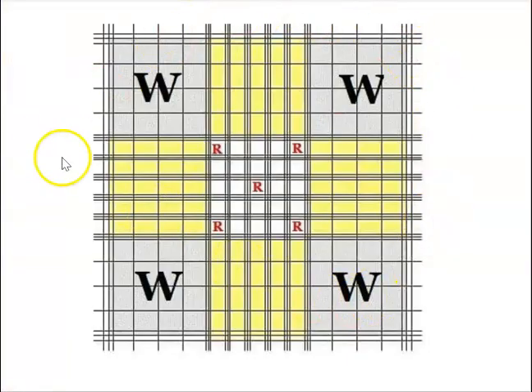Okay, so this is to show you the grid pattern on your hemocytometer. So you have two of these grid patterns on your hemocytometer, and this will be roughly what each hemocytometer looks like. It may differ a little bit depending on the brand of hemocytometer you're using, but you have basically 9 large squares: 1, 2, 3, 4, 5, 6, 7, 8, 9.